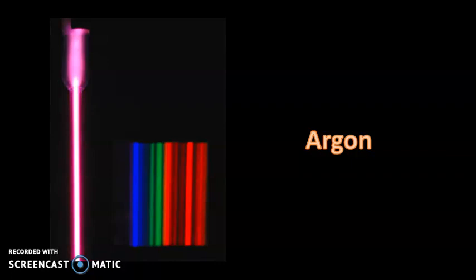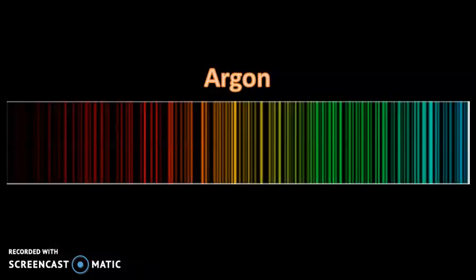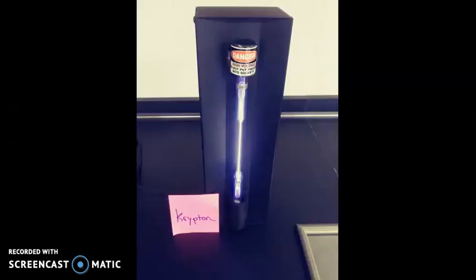It's just joining it together as one big fat line. That doesn't actually exist in these type of spectrum. So here's the official spectra of argon. Look at all of those lines. That's crazy. A couple other ones that are interesting.